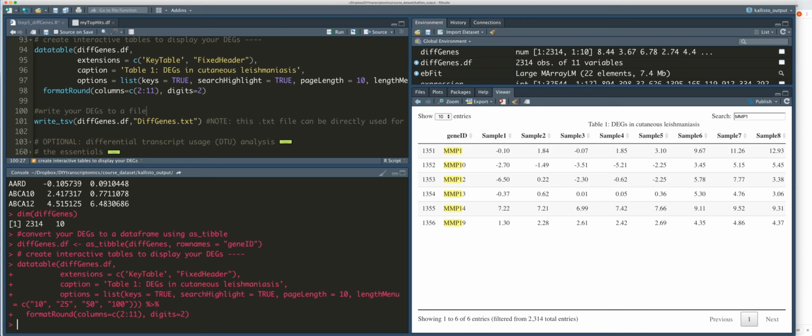In particular, what I referenced in the opening slides, which is differential transcript usage analysis, or DTU. And so what I'd like to do in the last part of this lecture is focus on how we can do this DTU analysis without really leaving R, without going back to remap our data in some other way, without doing anything additional in terms of backtracking.